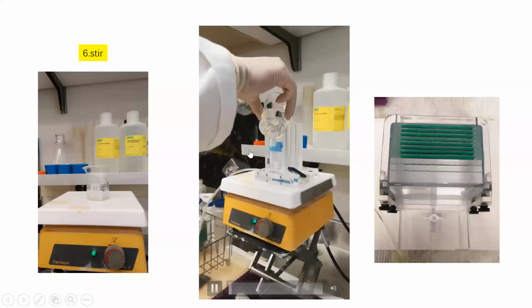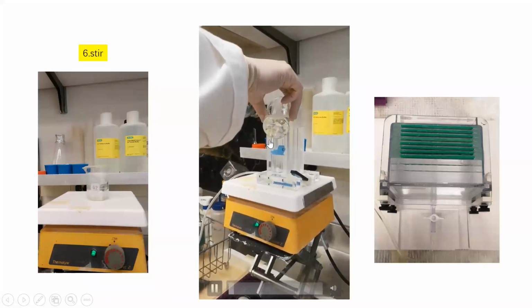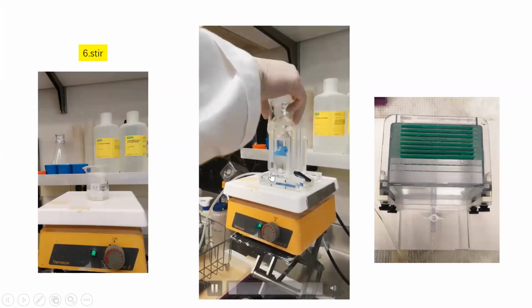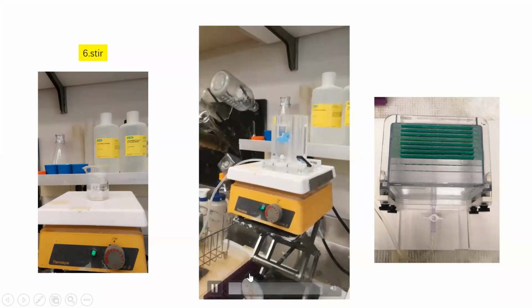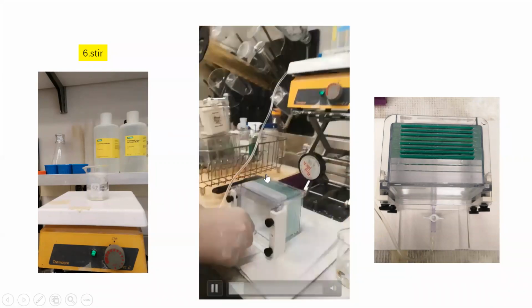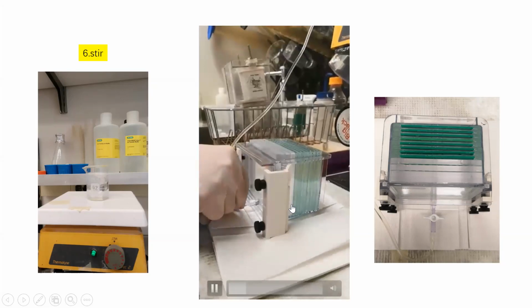You can see that we first pour down the 4% buffer here and open the switch below, and the buffer will go down to the chamber.